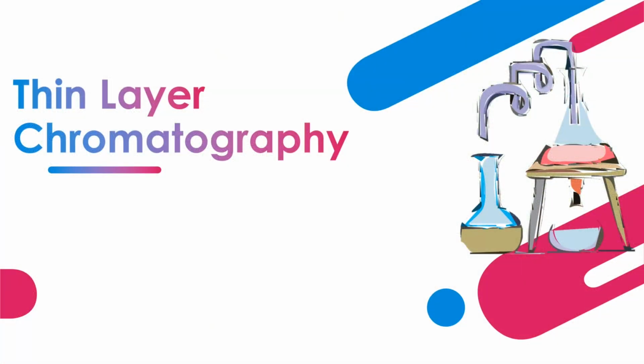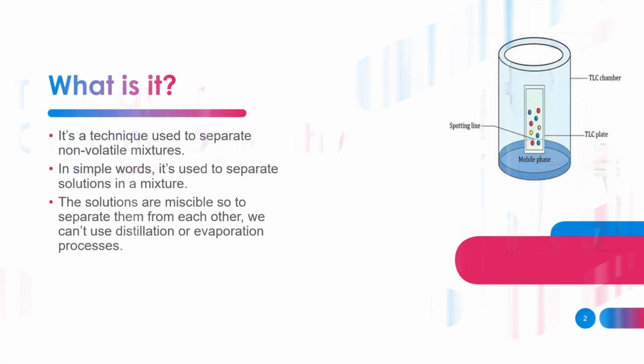Hello everyone, today we're going to look at what chromatography is and how it works. Let's go! Thin layer chromatography. What is it? It is a technique used to separate non-volatile mixtures. In simple words, it is used to separate solutions in a mixture. The solutions are miscible, so to separate them from each other, we can't use distillation or evaporation processes.